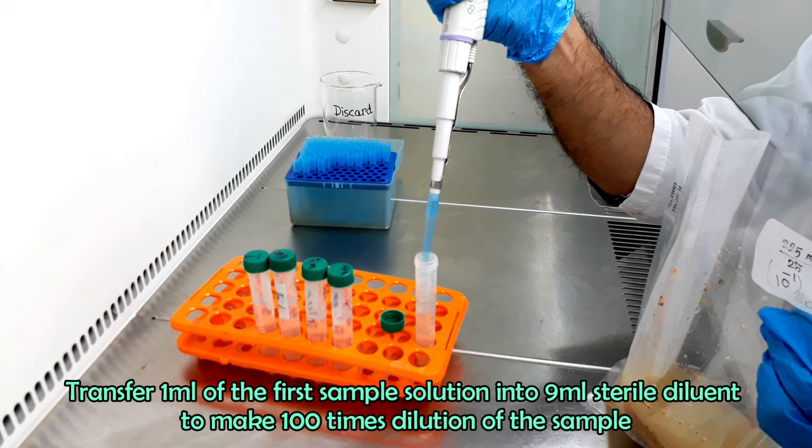We can see the lowest number of bacterial colonies in the last dilution plates. Let's count the colonies of 10 inverse 6 dilution. We found 85 colony forming unit in trial 1 plate and we counted 78 colony forming unit in trial 2 plate.